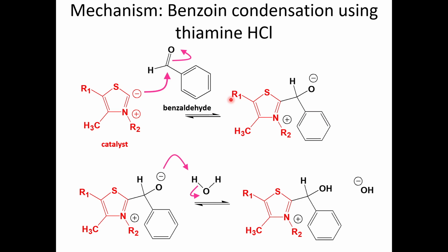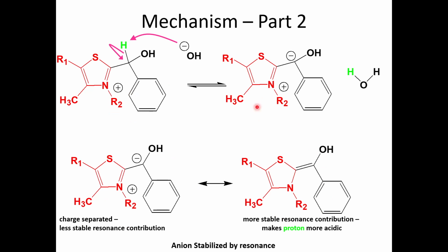So let's go to the mechanism of this reaction. The first step is the base attacking the carbonyl group of the benzaldehyde, making this tetrahedral intermediate, which is going to absorb one proton from the water, and then we get this alcohol derivative. After that, another hydroxide that we have in the medium is going to grab this proton from the previous intermediate, and then you're going to form this carbanion, which is in tautomeric equilibrium between this and this with a double bond, and they are resonance structures.